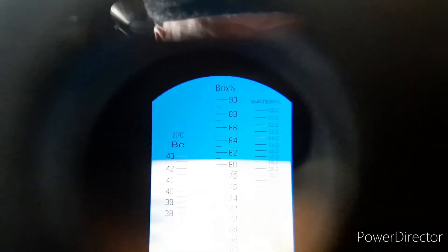Let's hope it can focus, will focus. And it's not easy. There it is, you can see it's just below 18.1 percent. It's about 17.7, 17.8 which is perfect.